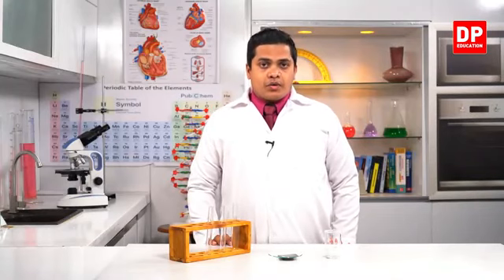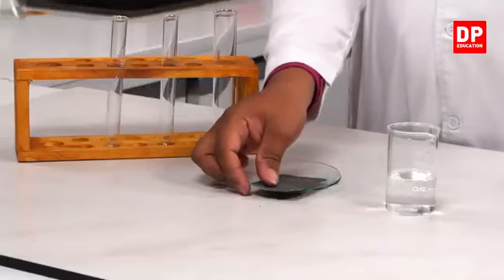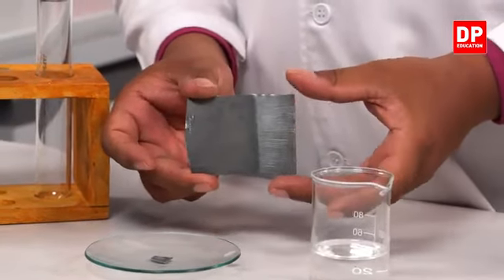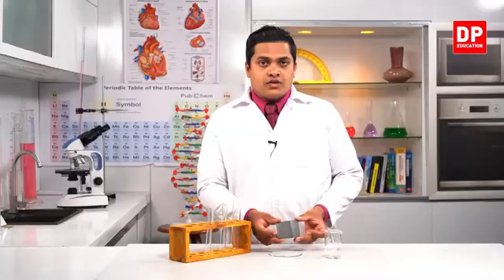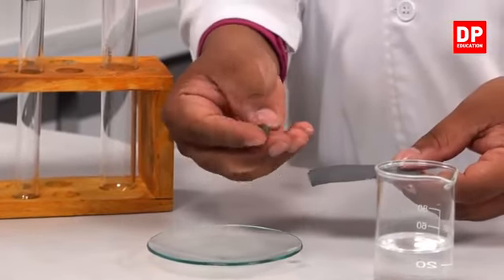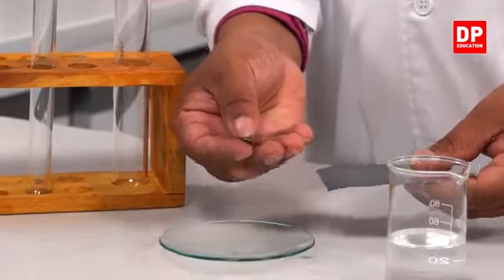Right, my dear children, now this is our next experiment to observe what are the evidences that we can provide during a chemical change. So here I have a zinc plate. This is zinc. Zinc is a type of a metal. So now I have separated a small piece of zinc.